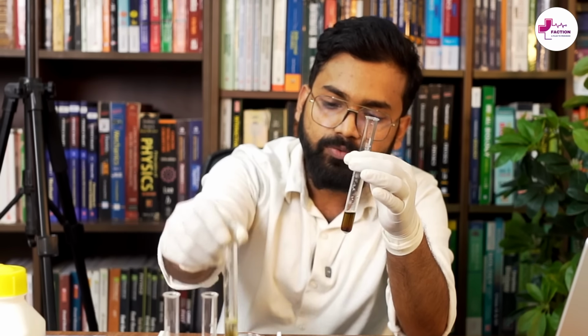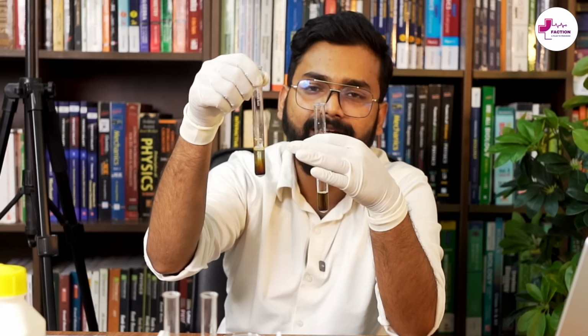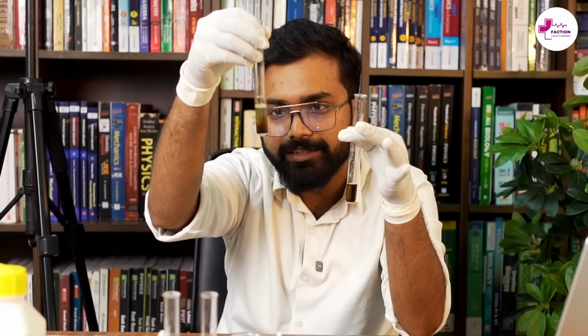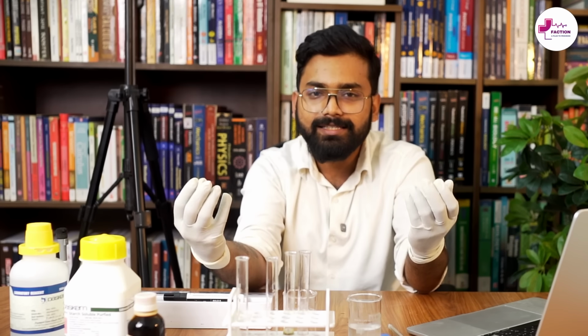This was test tube 2. It should not have been blue black color due to amylase action and it is not blue black color. This is the original color of iodine that was retained. In the presence of starch, iodine turns into blue black. In the absence of starch, iodine retains its original yellowish or brown color. So this was the experiment in which we proved the presence or absence of amylase enzyme in a medium containing starch impacts the starch test.